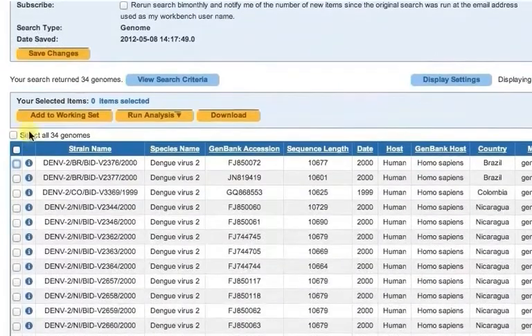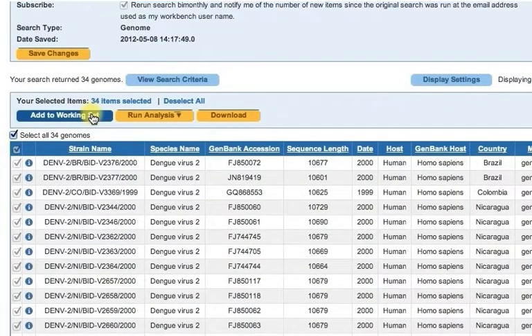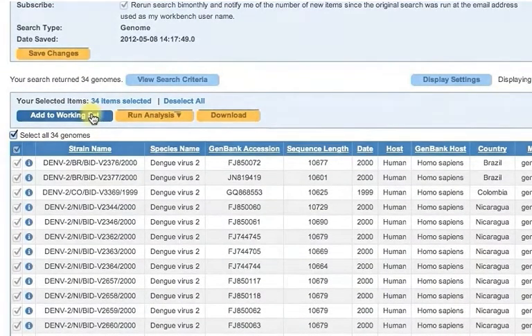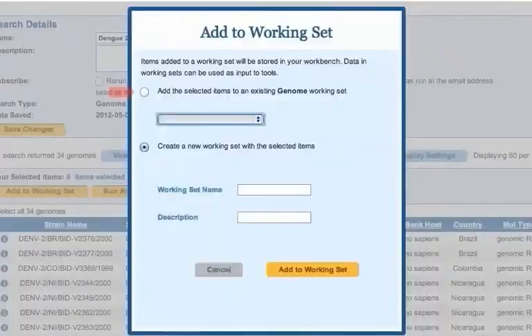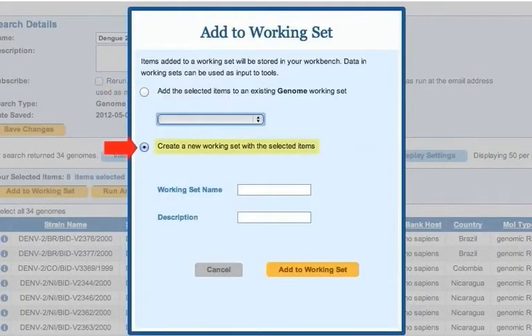Select the desired items from the search results and click the Add to Working Set button. You now have the option of either adding the selected items to an existing working set, or creating a new working set to hold your selected items.